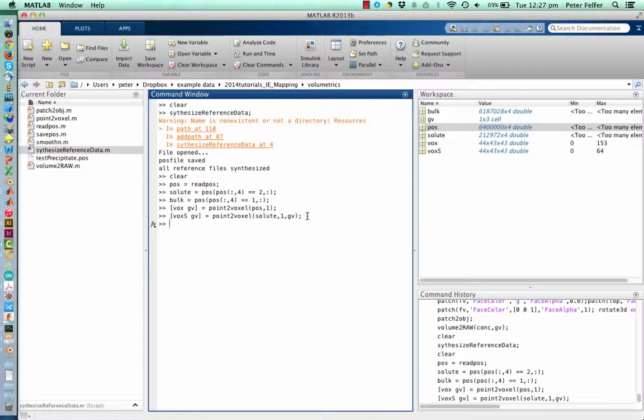I've integrated actually a more modern smoothing algorithm that's used very often for CAT scanner data, that uses higher order functional approximations of the concentration field that you're producing. This is probably a little bit more modern than what we're using in atom probe currently. Anyway, whatever you can justify, you can use, of course.